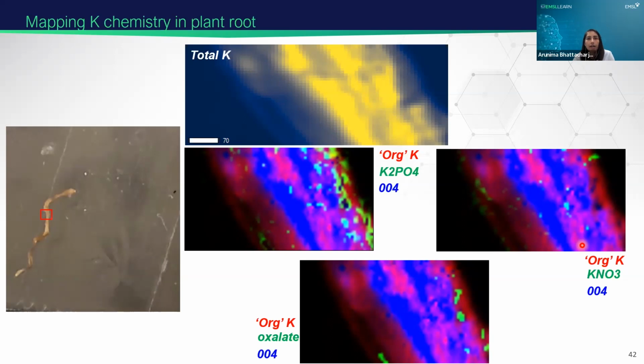So this is an example of how you can reproduce different mineralogy inside of these chips and look at interaction between a plant root or a microbe. We can also do this with bacteria if you have a particular bacteria of choice. In general, reproducing these different types of chemistries and porosity and aggregate morphology is still a reduced environment, but you try to go closer and closer to soil. And again, if you have a hypothesis that you couldn't test in soil because of the heterogeneity and opacity of soil, this is the perfect platform for that, where you can visualize these chemistries using optical microscopy and different chemical microscopy methods.